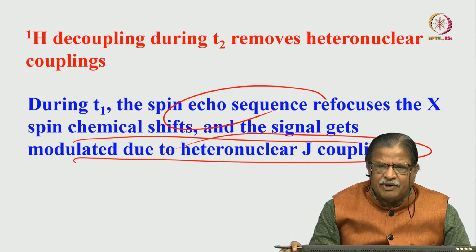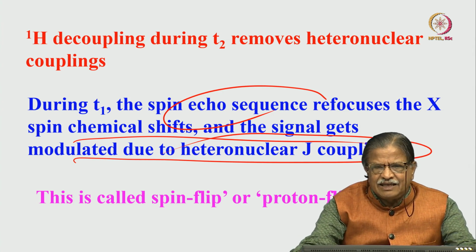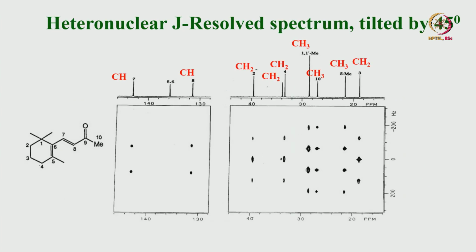That continues to happen here also. There is an experiment for doing this, called the spin flip or proton flip method. We will understand those things later.